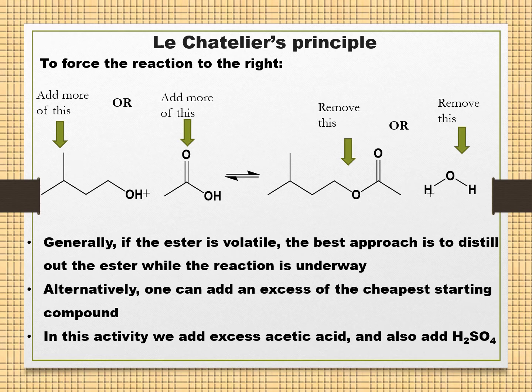Whereas if you choose to operate the reaction with respect to the product, the recommended way is to undergo distillation immediately while the reaction is ongoing. Okay, that will help us to distill the ester quickly while the reaction is undergoing. Then that will make us have the product in the process.